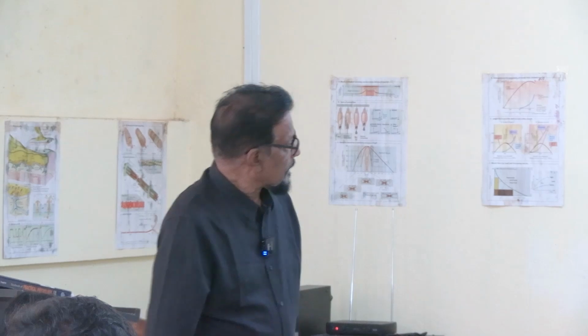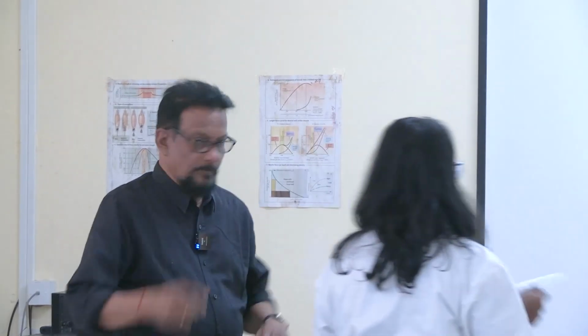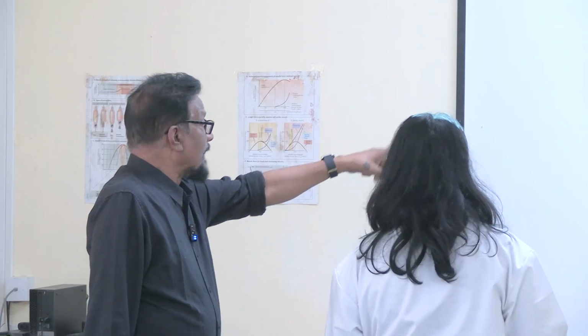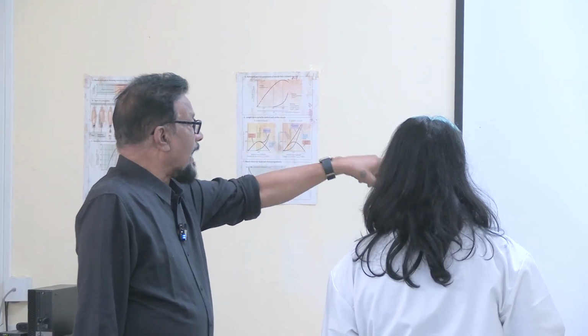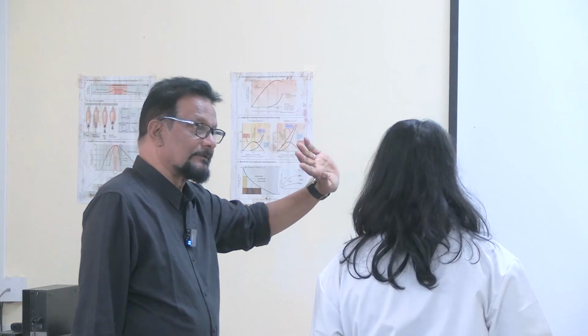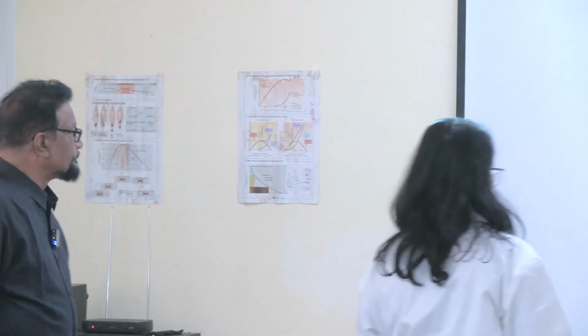Okay, now see. You will now measure the contraction period. You dictate how many frequencies there are, so they will calculate the time for normal, for 40 degrees centigrade and for 10 degrees centigrade. Take the twitch with the 40 degrees centigrade Ringer and the twitch with 10 degrees centigrade, and calculate the contraction period.